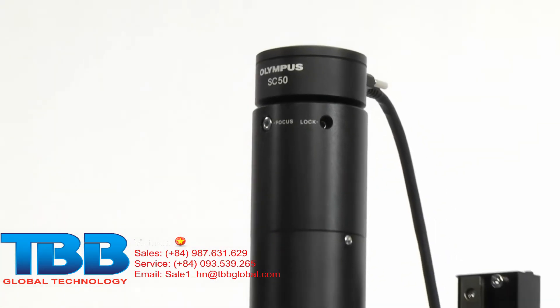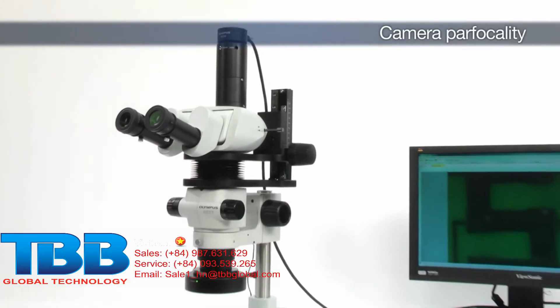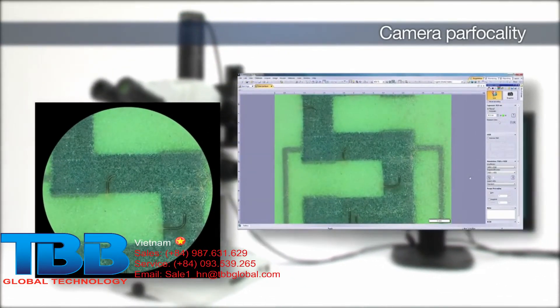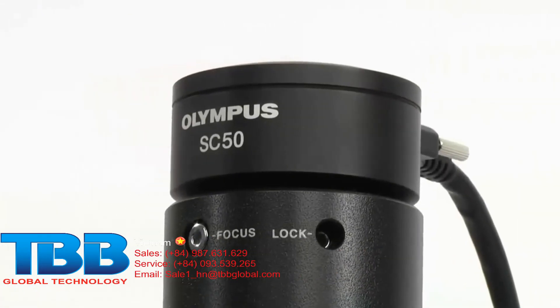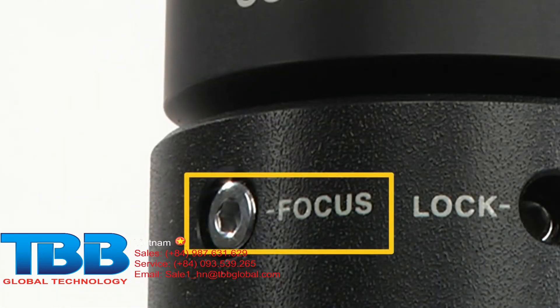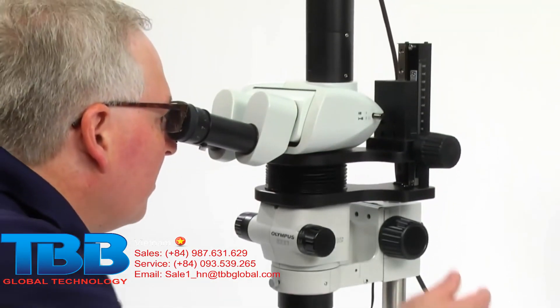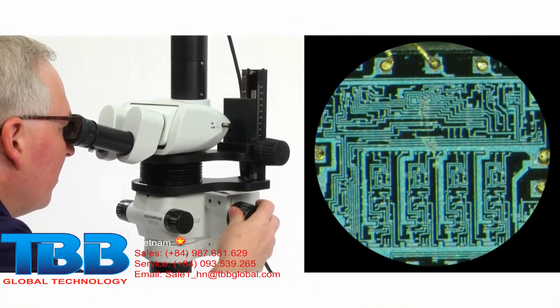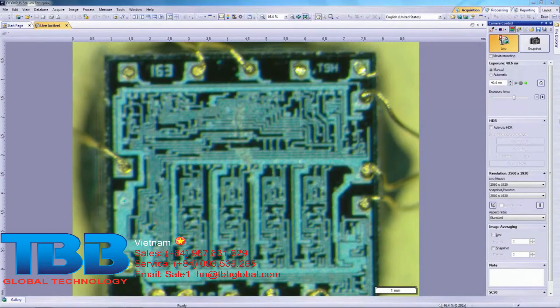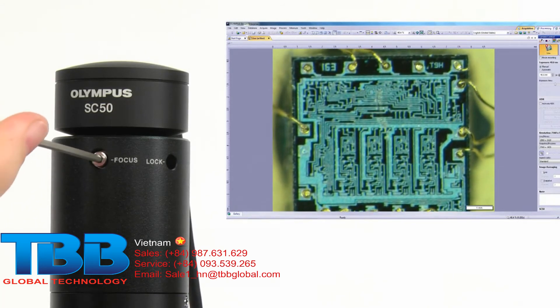For stereo microscopes equipped with digital imaging systems, proper camera parfocality is important to help ensure that the image viewed through the microscope and the image displayed on the monitor are in focus with each other. For this procedure to work, the microscope should be equipped with a camera mount that has a built-in focus adjustment. First, place a sample on the stage plate. While looking through the eyepieces, bring the image into focus using the microscope focus knob. Display the image on the monitor. If the image on the monitor screen is blurry, a parfocality adjustment is required. To adjust, simply turn the focus dial on the camera adapter until the image on the monitor screen is in focus.